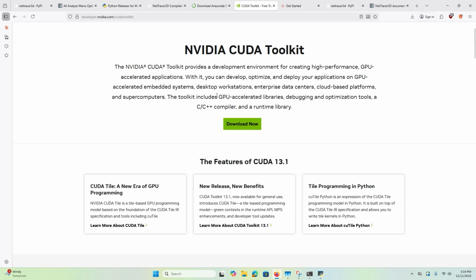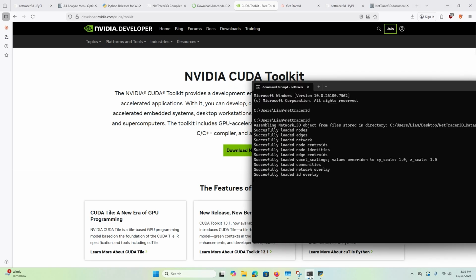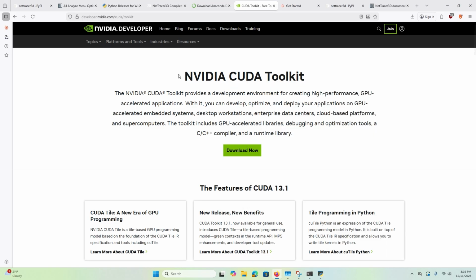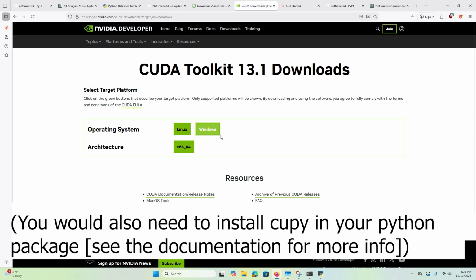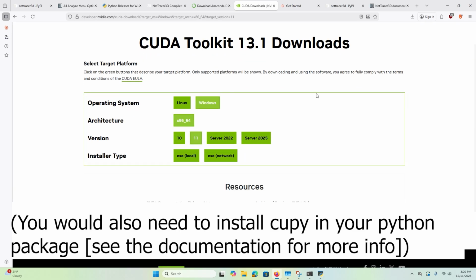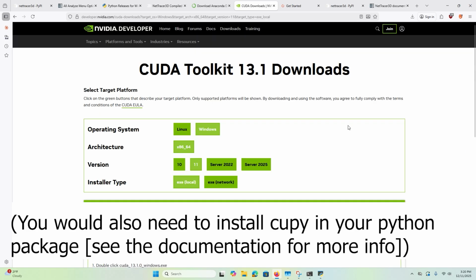Regarding this thing, I do have a few GPU functionalities in the program, but they're not super robust. But if you want to, it's not super hard to set up the additional stuff you would need. If you were going to want to set those up, you would need to download the CUDA toolkit. Basically, it just depends on what NVIDIA GPU you have, and you can look up what your GPU is compatible with, and then you would want to install the corresponding toolkit, and it's basically just something you download and then you get walked through by an installer.